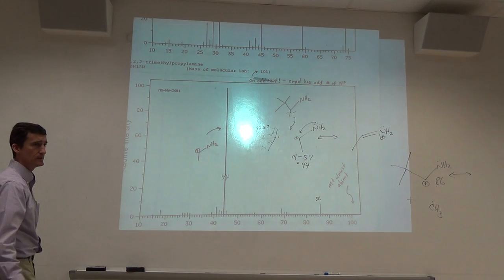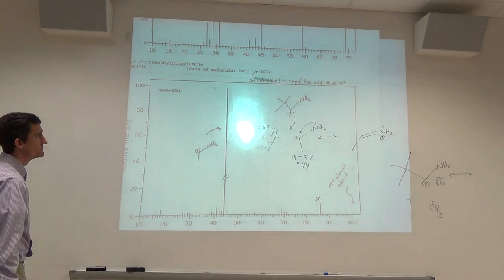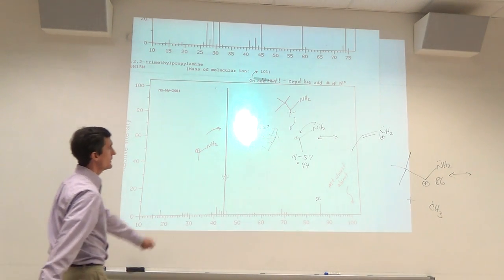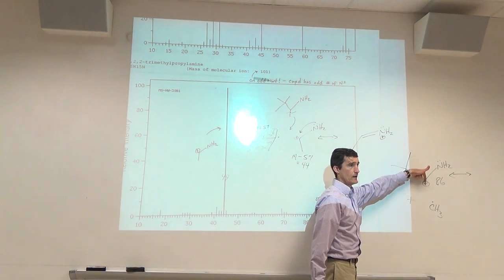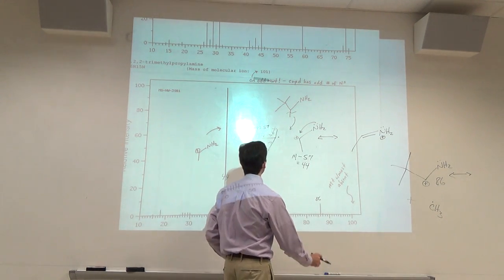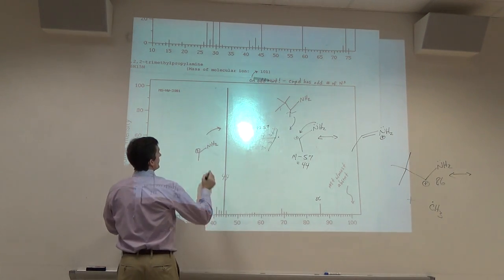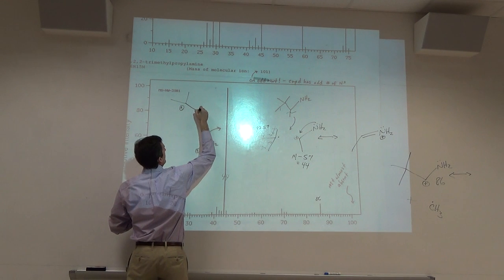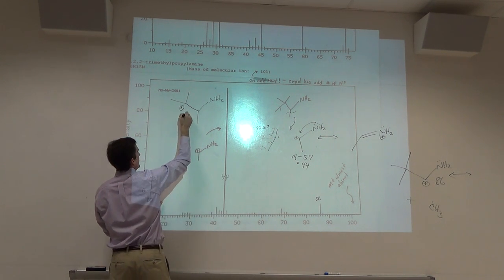Allison, you had a question? Oh, yes. Why did you cut off that specific carbon versus any of the other ones? Well, cleaving there gave a resonance stabilized cation. Oh, okay. So we did alpha cleavage. But we could have maybe cleaved here. Would that have been reasonable? If we had cleaved there, we could maybe propose that cation, which would also be 86. Wouldn't that also be 86?